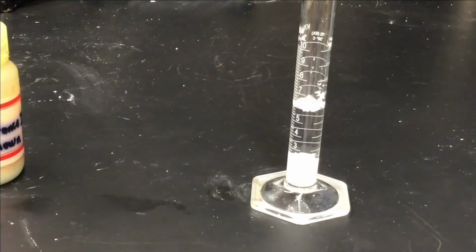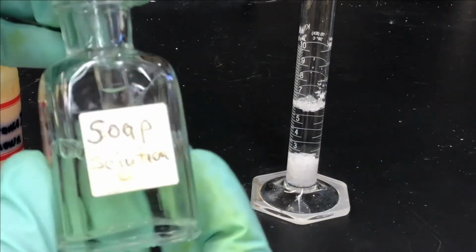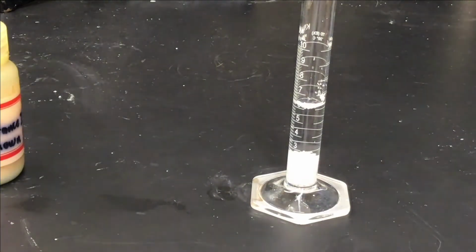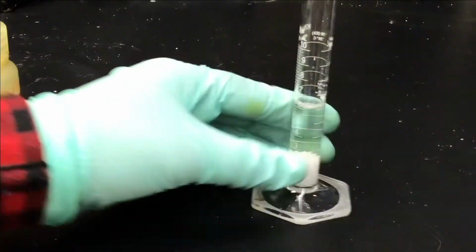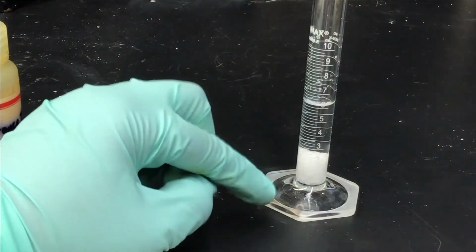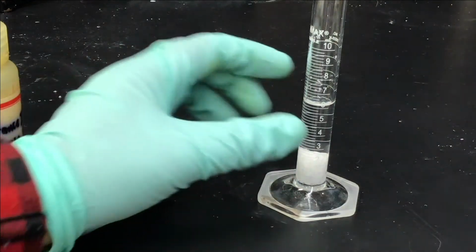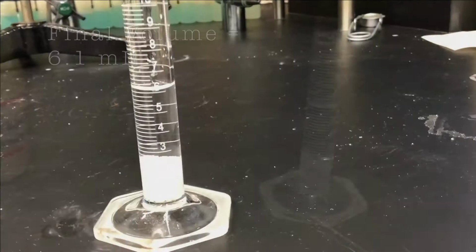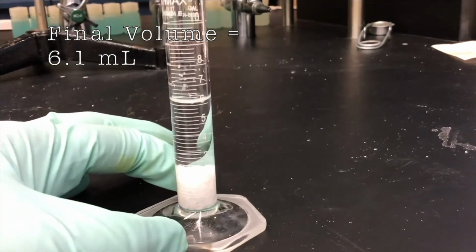After we see that gentle taps are not making all of our solid go to the bottom, we're going to add 2 drops of soap solution to force the rest of the solid to the bottom of the graduated cylinder. Once all our unknown solid settles to the bottom, we're going to record the new volume in our graduated cylinder. Our meniscus is at 6.1 milliliters.